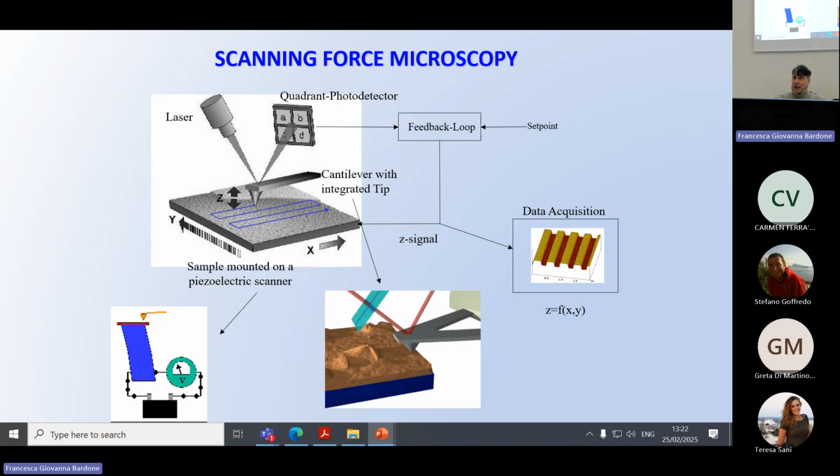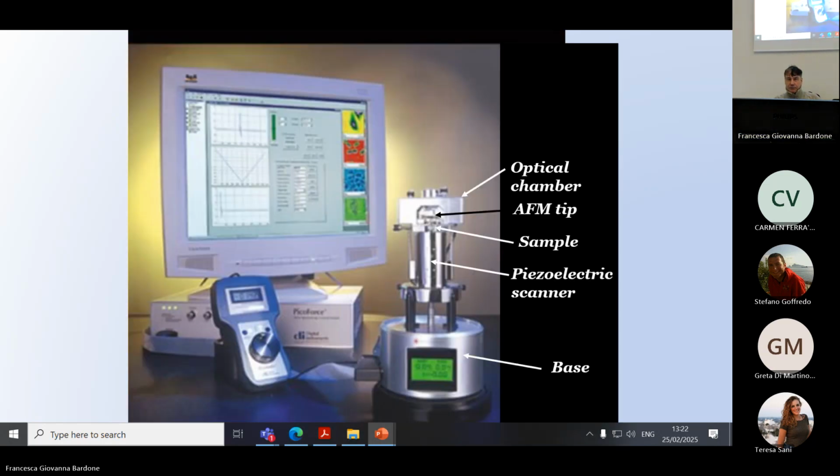It's not an electron microscope, it's a scanning probe microscope, which works in atmosphere, in liquid, whatever. You can think of different experiments. It's very, very small. This is the screen of a computer. This is the chamber. Here you have to put your specimen, 1 centimeter wide. This is the head in which you have integrated everything, the tip, the torsion, the measure, whatever. So it's called atomic force or scanning probe microscopy.